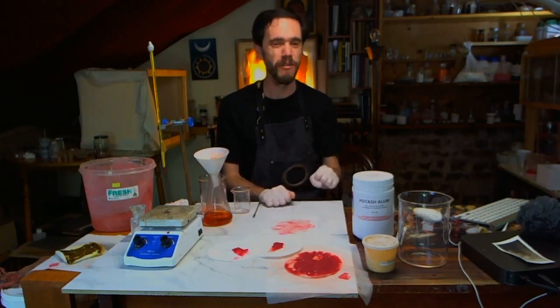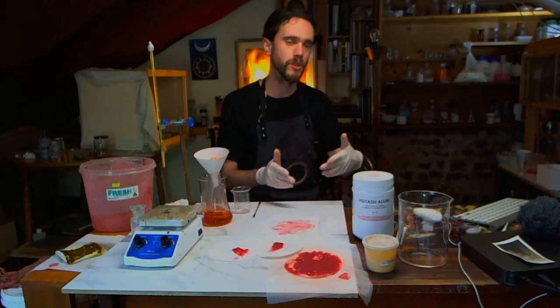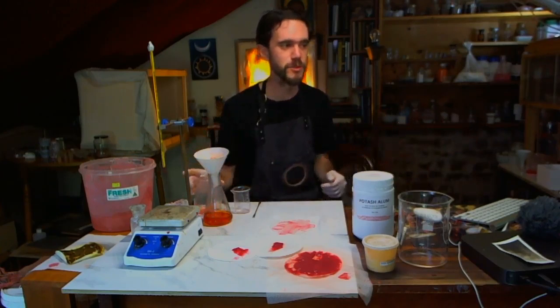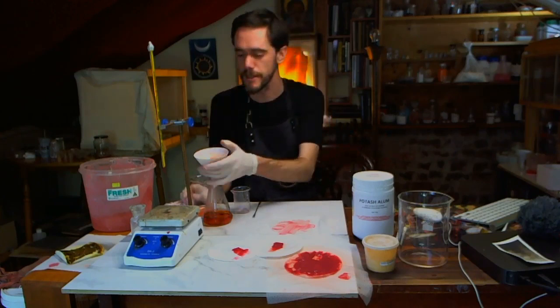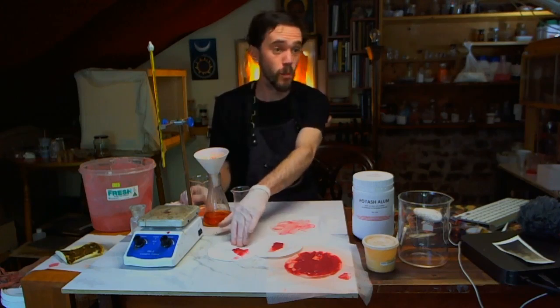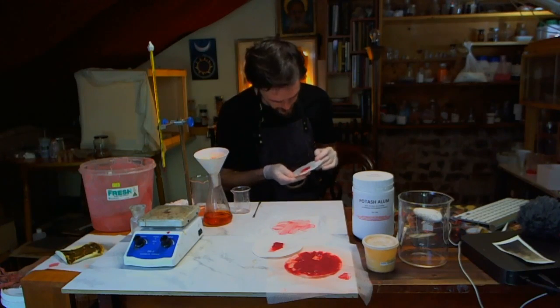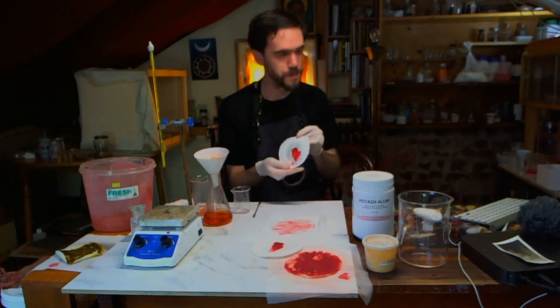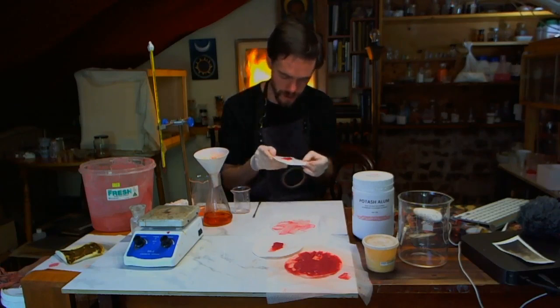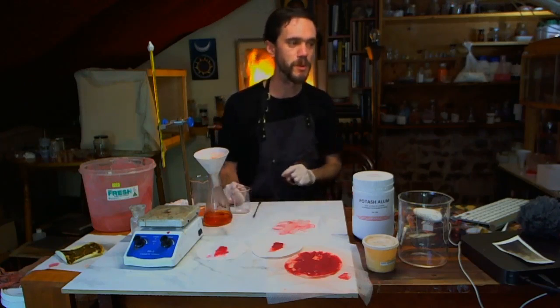Not to mention, lead sulfate is quite stable. It's a very, very stable thing. You can use it as an extender in oil paints and stuff like that. It's definitely had its uses throughout art history. So I'm not worried about there being any lead left in there. I would definitely wash this quite a few more times, but I think this is one of the cleanest and most pure samples of matter I've ever extracted, so shame it's such a tiny amount, almost unusable.